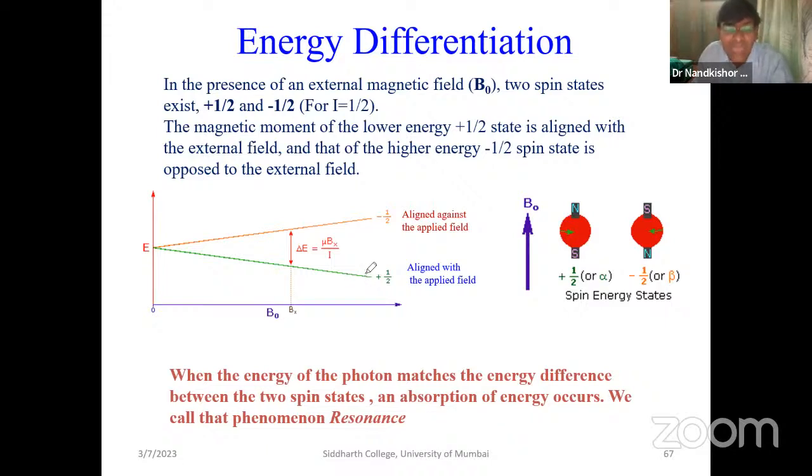That will happen when the energy gap matches the radio frequency energy, which we call a resonance. So the energy levels have a certain energy which matches the radio frequency, and that amount of energy will do the flipping, a plus half into the minus half, and that is what we call resonance.